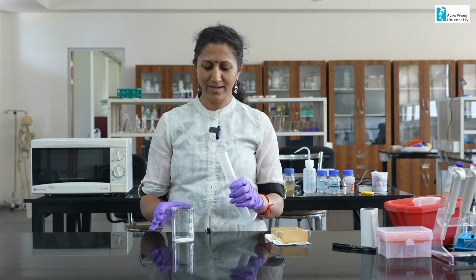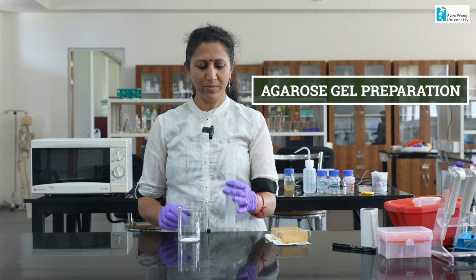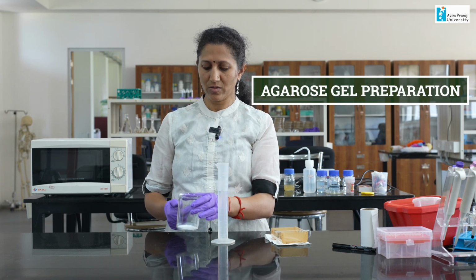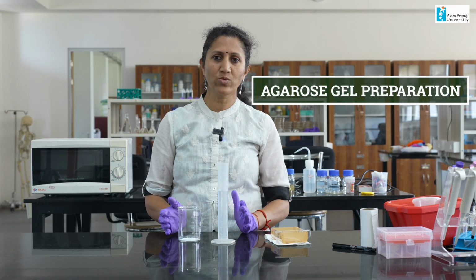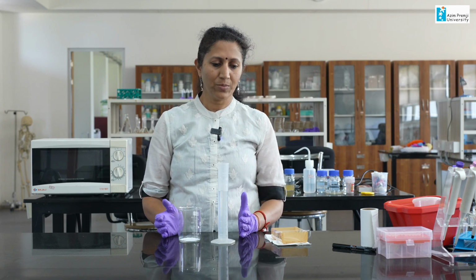By the time our PCR cycle is going on, let us prepare the gel which is needed for the next step. So, I have taken agarose in this. I am going to prepare 1% agarose gel. Usually you can use 0.8% also, but if you want even the small bands to be separated clearly, then you have to increase the concentration of the agarose. So, I am going to use 1% agarose gel.